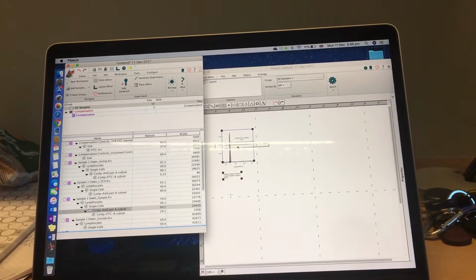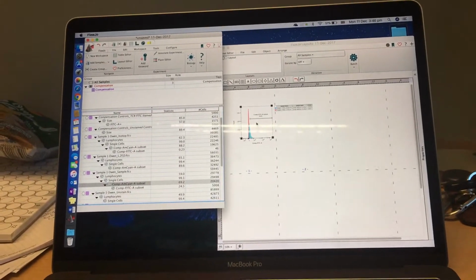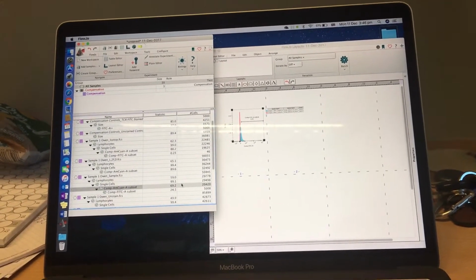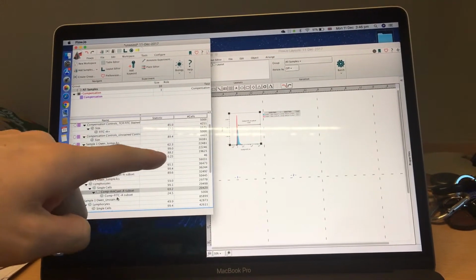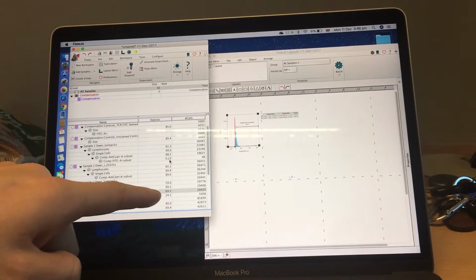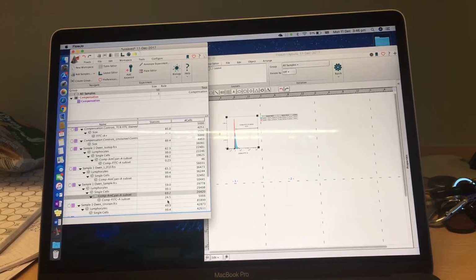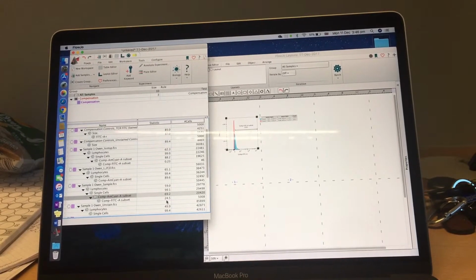See if there's a shift. Hey, there's a little shift. Tiny, but there's a little shift. Zoom in. So it seems I did it right on the FACS machine. Good. Let's have a look. You've gone from 0.23 of the population to 24.5% of the population. So there is a shift, of about 100-fold.